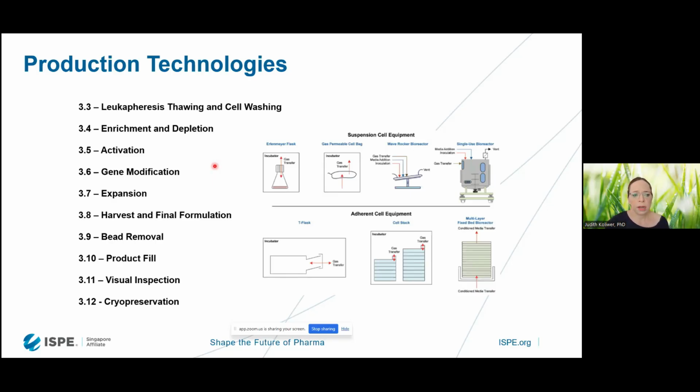Something that we suggest to consider here is really the addition rate, and also the shaking of the vessel during the addition of the vector, because that again has been shown in the past and also published to really change both the cytotoxicity but also the success rate of our viral transduction.